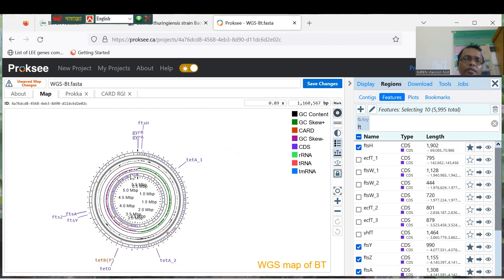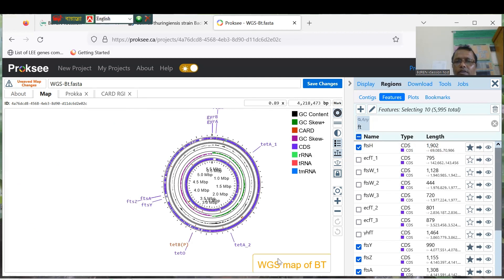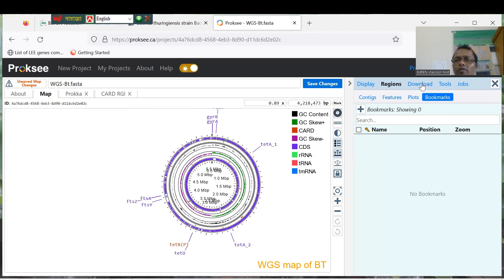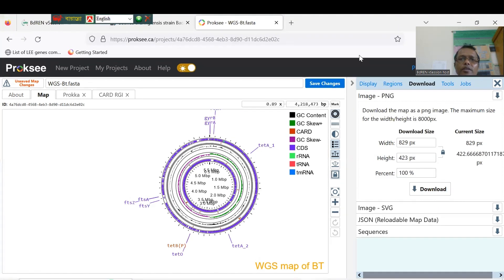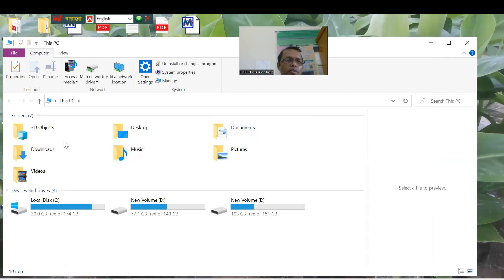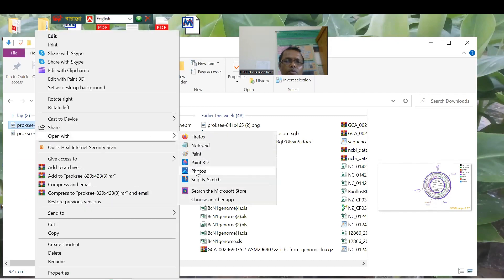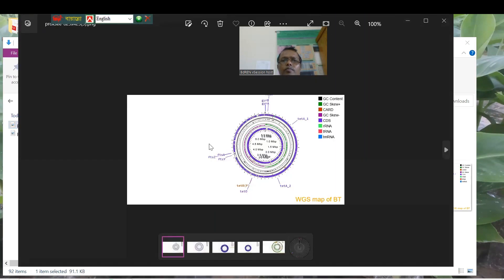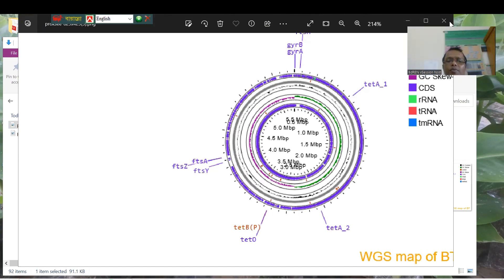You can see so many genes displayed in your map. You can download the picture from here. This way you can prepare the circular map of your genome, annotate all the genes, and find specific genes using the search tool.